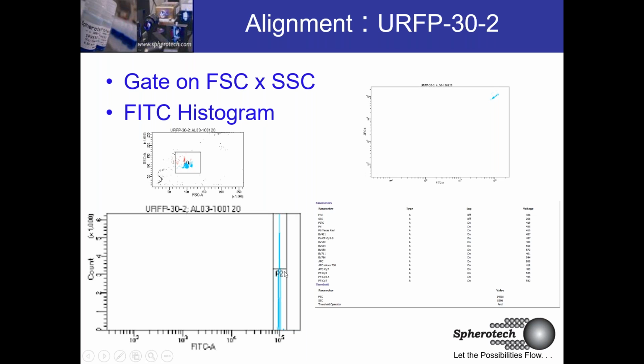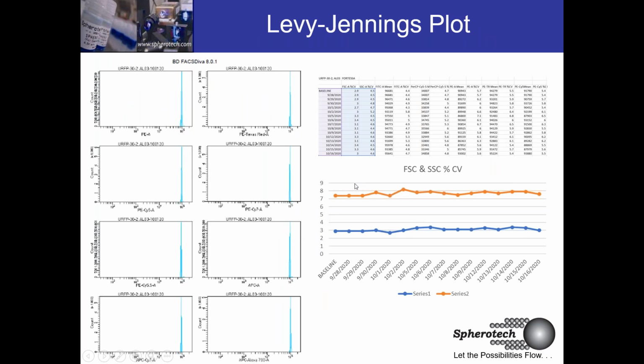And these alignment particles day to day might not seem terribly interesting, but what we're looking for is these very slight jumps that will happen left and right, or widths, right? In order to determine, over 30 days, I collect this same piece of data. And I only did it for 15, and I did it across, you know, a number of channels here. And you want to set acceptable ranges.